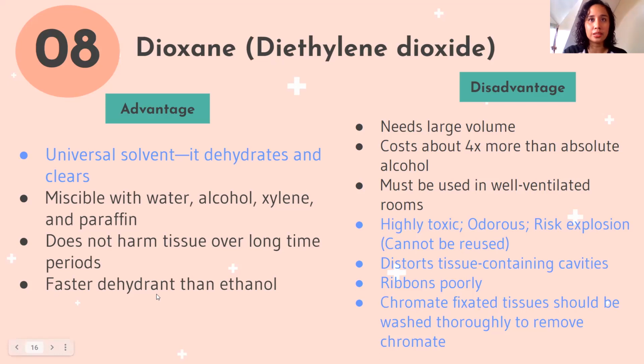Faster dehydrant. However, it needs large volume, costs more expensive, and it's highly toxic. Yun lang. Highly toxic siya. And guys, you could not reuse it. Kasi once you reuse it, class, peroxides are formed. May nagpo-form siya ng mga peroxides. And these peroxides could be explosive.